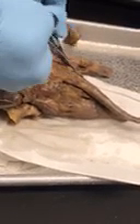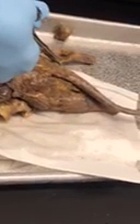Now where you have to be a little bit careful is on the medial side of his legs, because this area with the fur, that's his anus and his genitals, or hers in this case. So there's anal glands there that you don't want to puncture, so just leave that furred area alone and go between the leg and the furred area. You can get that connective tissue out, okay?